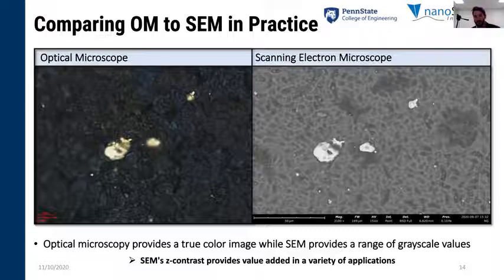And we can actually go the other way as well. So if you look closely at that SEM image towards the top right, you can see some darker areas, little darker gray shades. What this indicates is that there's a material on the surface that's a lower atomic number than silicon. So if you think of the periodic table, you think of things like carbon, 6, oxygen, 8, nitrogen, 7, organics, right? So the SEM image gives us that type of information as well. And if you try to find that same information looking at the optical image, you don't see that at all. There's no evidence that there's smudge there or dirt on the surface, whereas in the SEM, we immediately get that. And then we can take all this to the next level, as I'll show you later. We can do EDS, and we can actually confirm these materials are what we think they are based on the Z contrast.